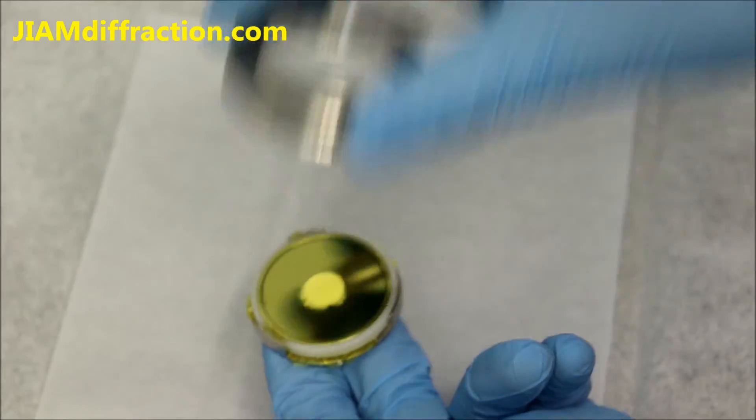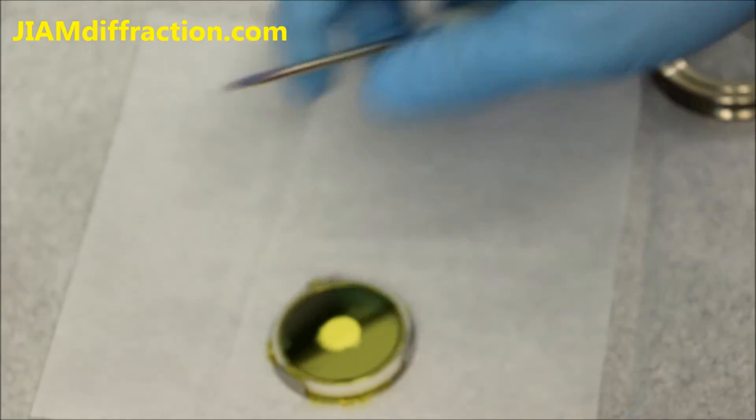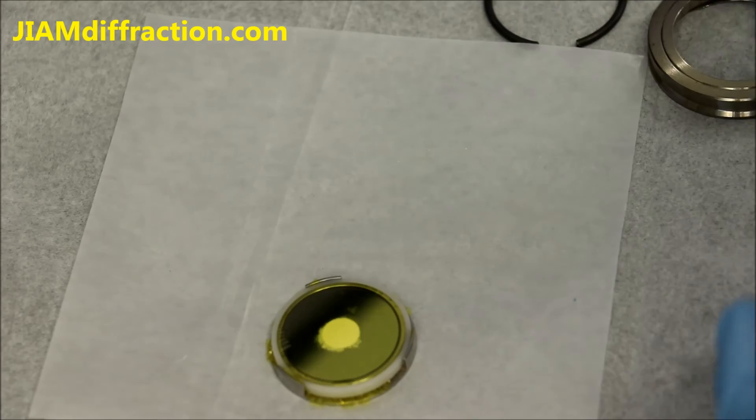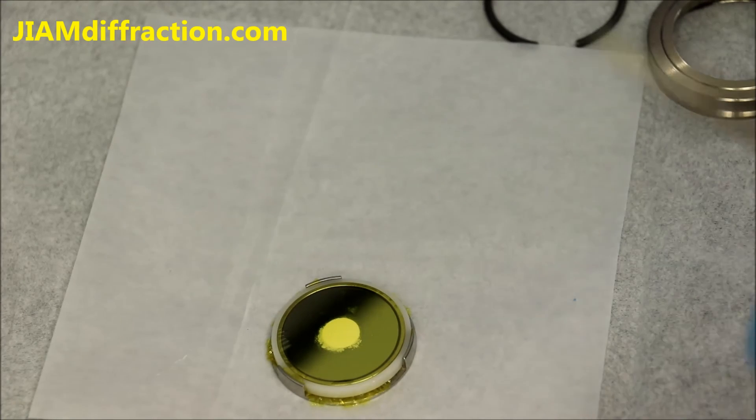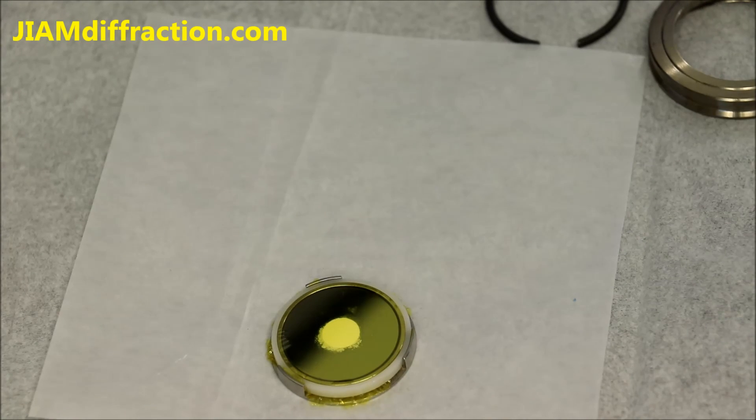You can then remove the sample holder, take that ring out, preferably not with a screwdriver, you want to use something a little bit softer so you don't damage the ring.